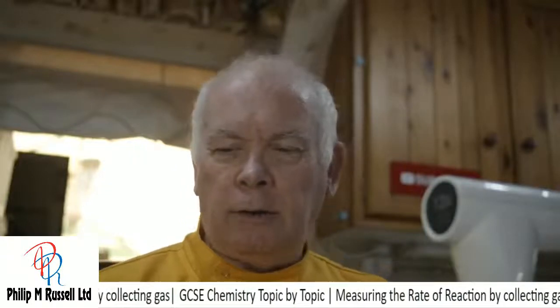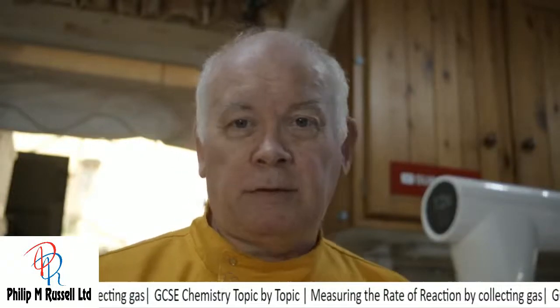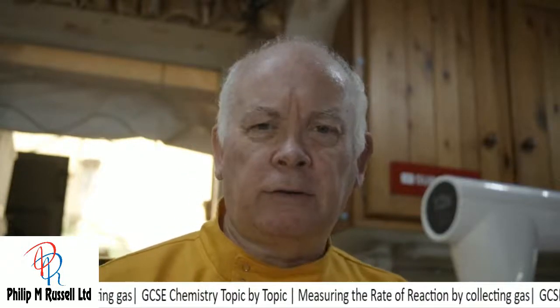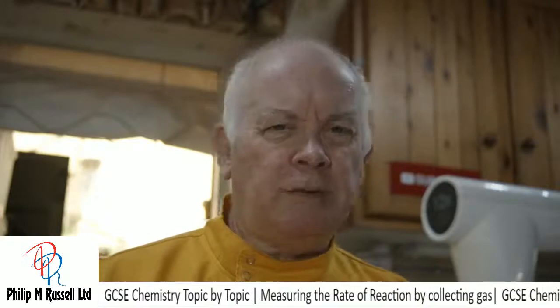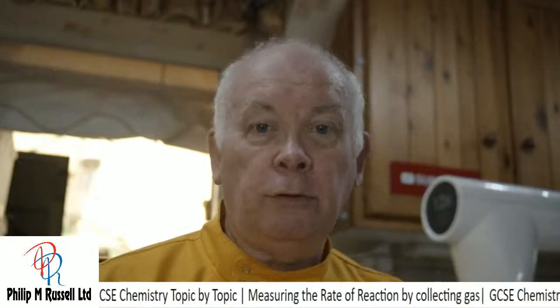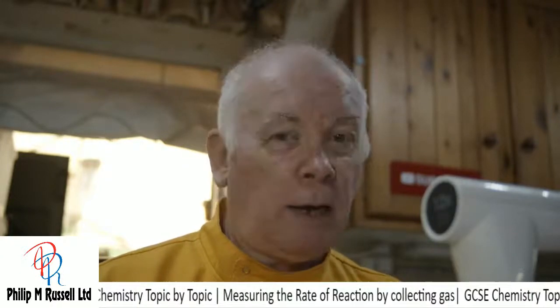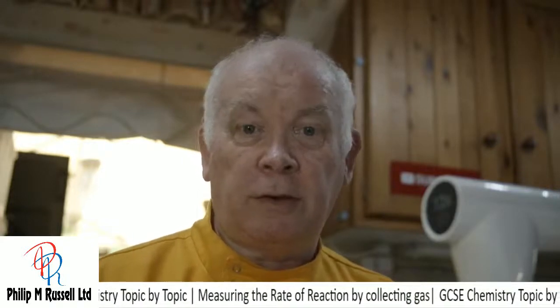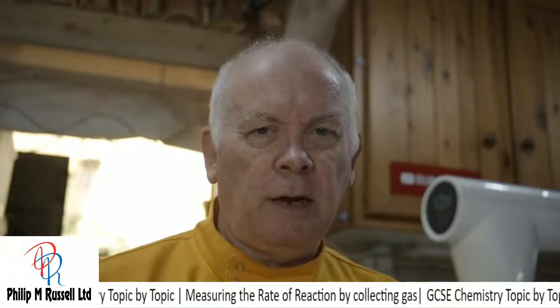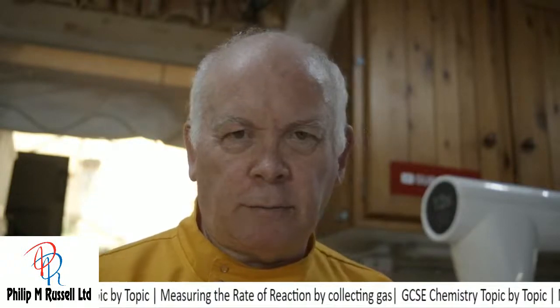Last time I had a look at rates of reactions, and I used a balance, very badly in fact, to look at how particle size affects the rates of reactions. I'm going to do the same experiment today, but I'm going to do it two different ways. I'm going to collect the gas using a gas syringe, and I'm going to collect it over water, and we'll have a look at different ways of doing the same experiment, and we'll get some data and we'll see if we can plot it and make some sense of what we've got.